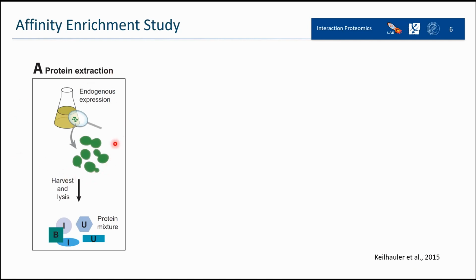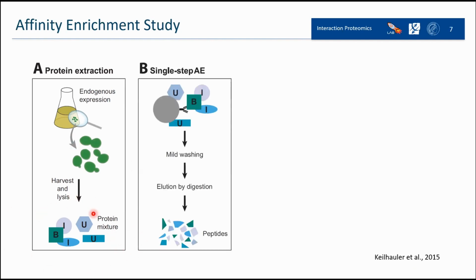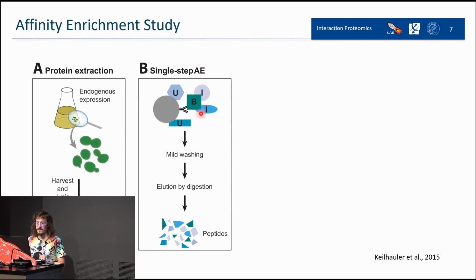They used yeast in which some specific proteins were marked with GFP in order to then select these proteins specifically as baits. And then they took the lysate and added a protein mixture. Then they performed what you saw before. They had their antibody that was supposed to select specifically the bait, B, shown here. And this bait, as I said, was tagged with a GFP protein, so there was a GFP domain that will attach selectively to the antibody.